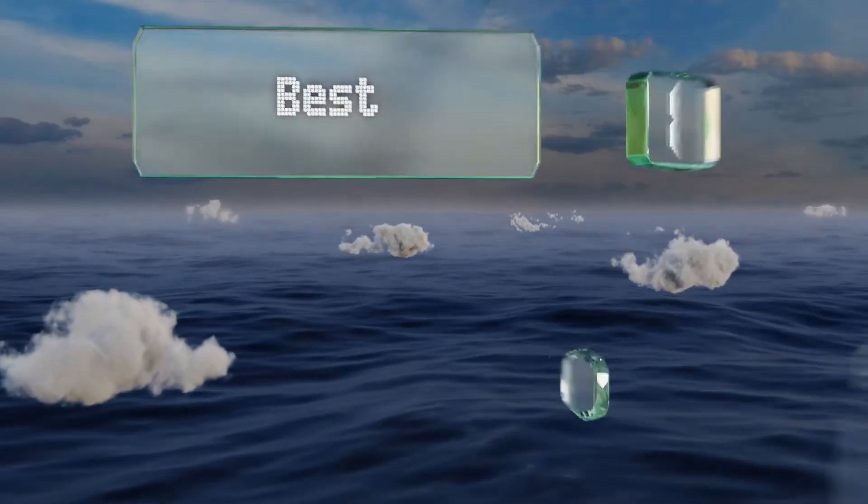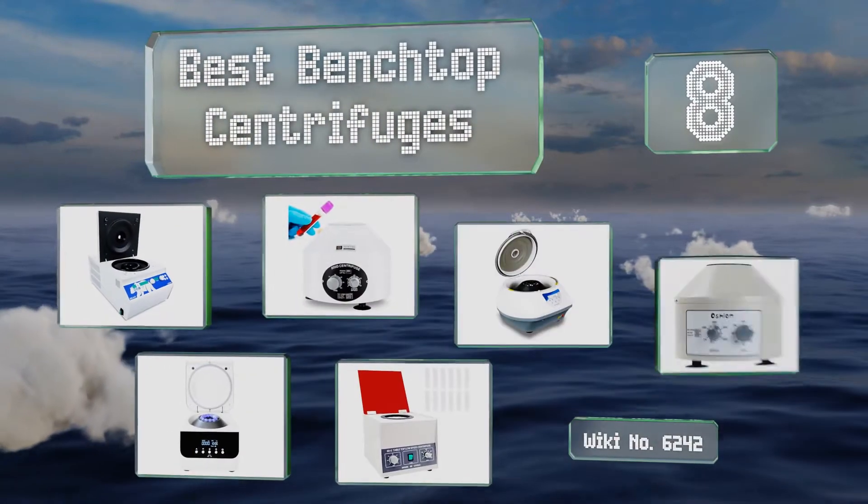EasyVid presents the eight best benchtop centrifuges. Let's get started with the list.